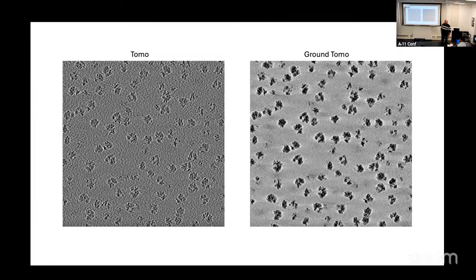Okay, and so the simulated ones, you set those other parameters? Yeah, I guess the closest thing to a noise parameter is the dose. You just turn that up and down. So you can control all of that.